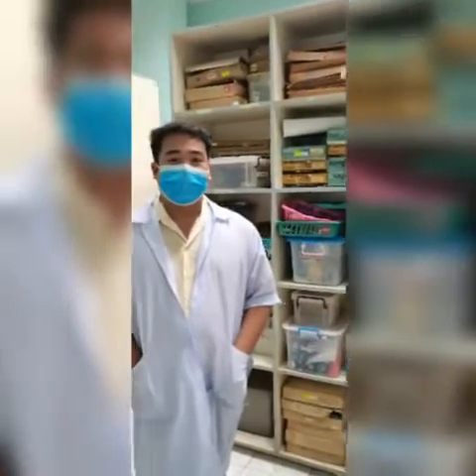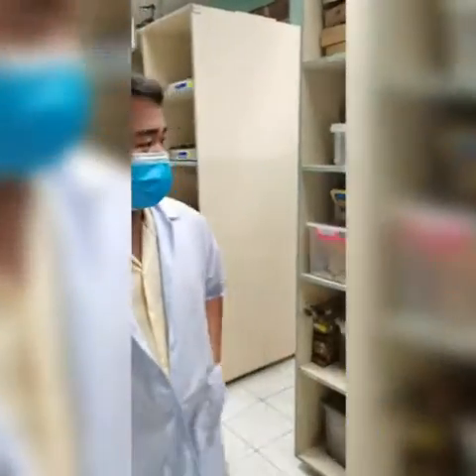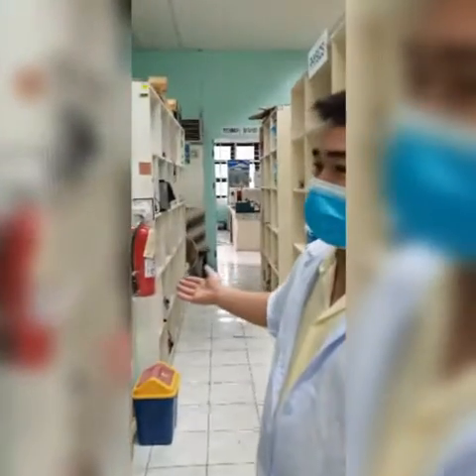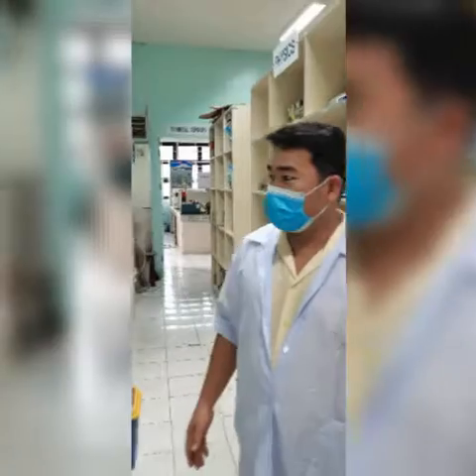Here at the equipment section, you can also find the island cabinets for physics and biochemistry devices and equipment. So they are actually divided or categorized into different island cabinets. First we have the mechanics and optics cabinets, and we have the biochemistry cabinets where you can find common laboratory equipment for chemistry and biochemistry.